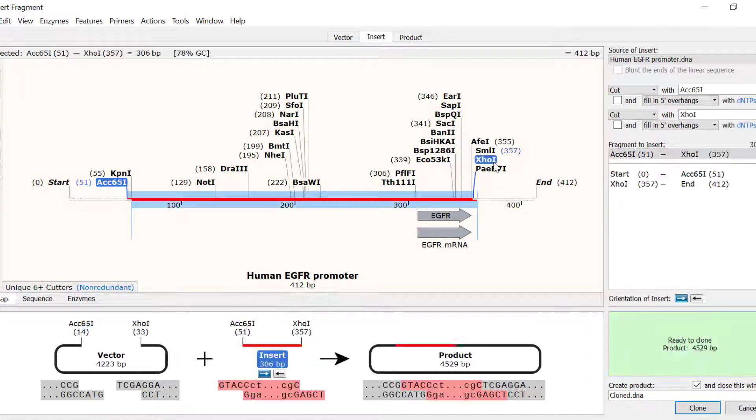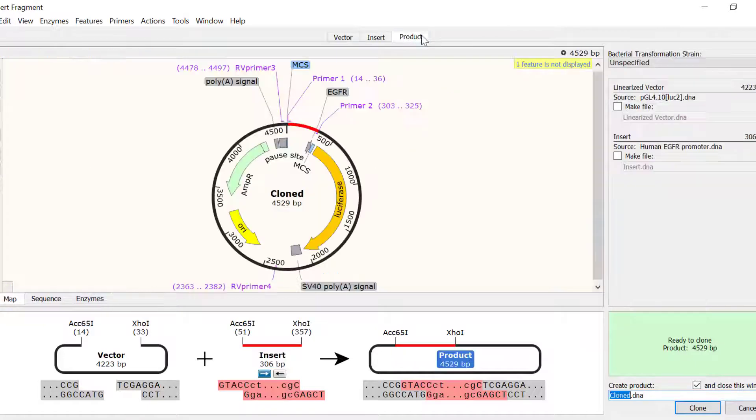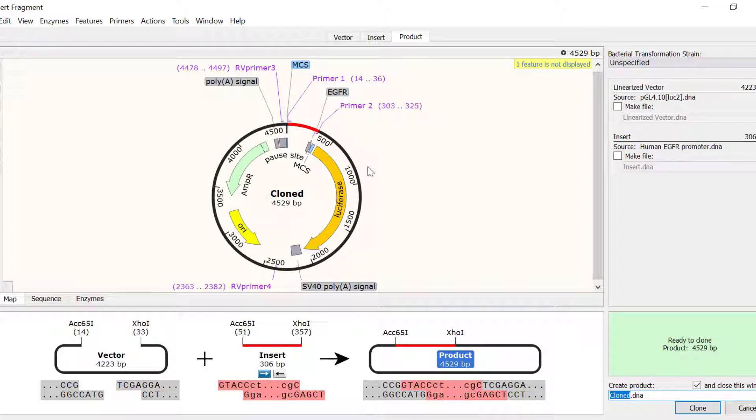I can then go to the Product tab to preview the final cloned plasmid. The region that is being included in the cloning is coloured black, which corresponds to the vector, and red, which corresponds to the insert.